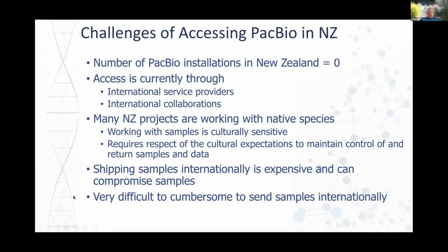I think people in New Zealand are realizing this. There were some decisions made many years ago that, okay, we think we can just send stuff offshore and sequence it elsewhere. But that is challenging, and it's borne out by the fact that most of the people doing PacBio sequencing in New Zealand are connected to international collaborations, and they have gone through a lot of effort to work through the things that are required to send samples offshore.